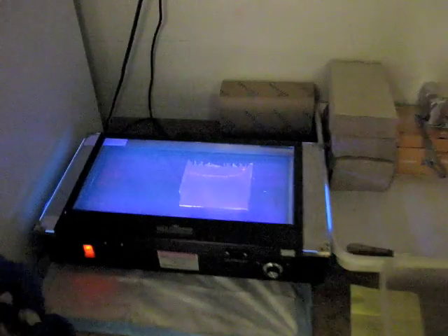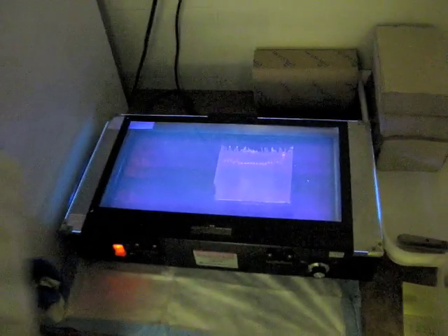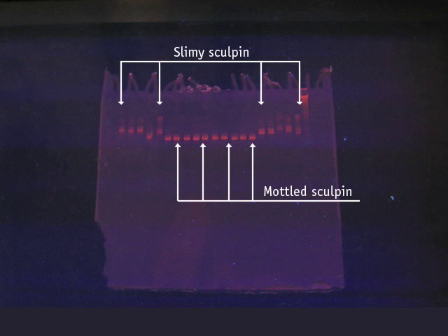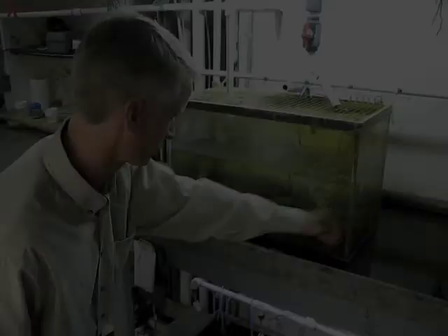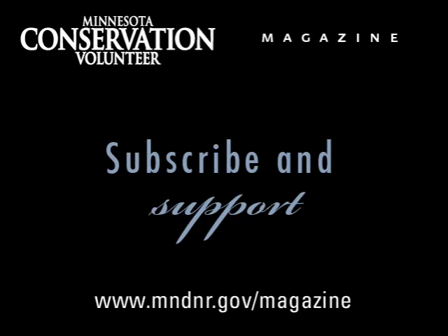And it did work well. So now, as you see, running down the gel — there are 20-some samples in this gel. Running down a column is an individual fish, and the bright bands that appear are the DNA showing how far they migrated. The ones that have gone lower have migrated further through the gel. I know from this that those are one species — in this case, sculpin. That's a small fish, especially common in trout streams and cold water streams. A lot of our work has been on southeast Minnesota, looking at these sculpin populations.